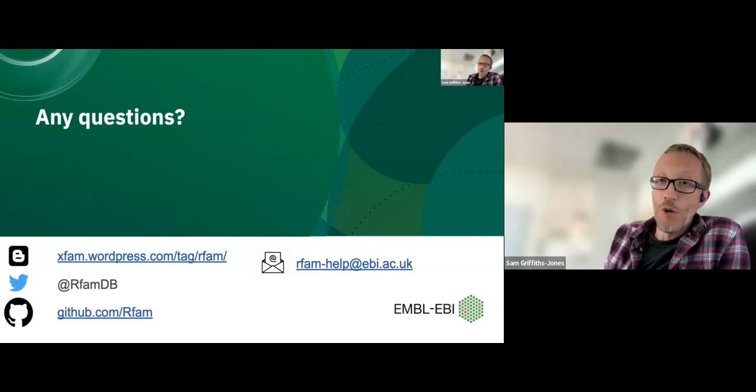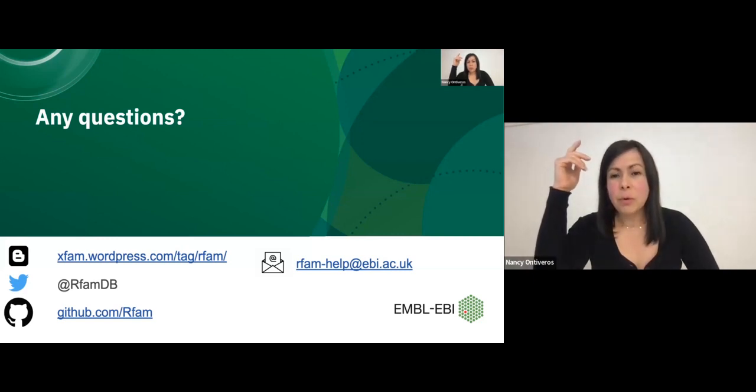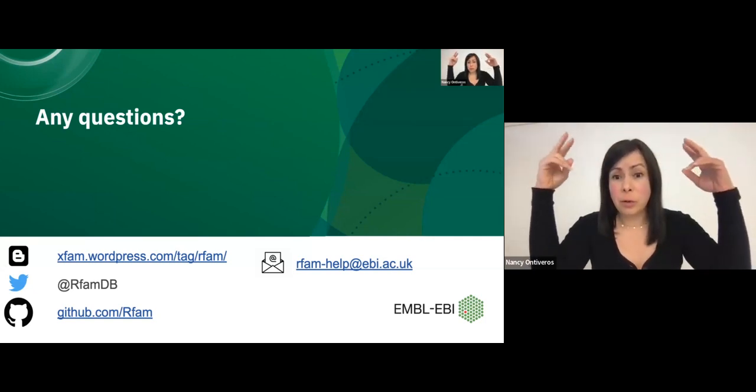Much more complex and difficult would be to try and get into improving the model yourself, which is not impossible, but it is a different kind of task. If you were interested in doing that, then I would suggest you probably talk to these guys about that. This brings to me an idea also. Rfam has plans for models that represent the same family but in different phylogenetic groups. So that's why they are in a clan.